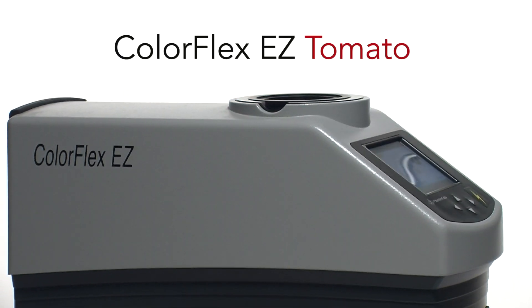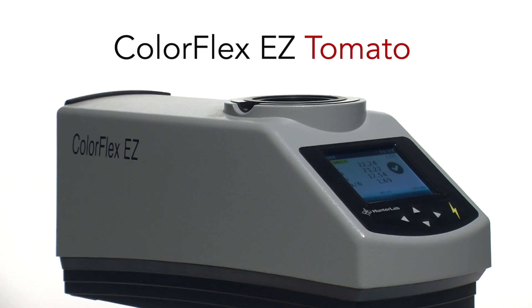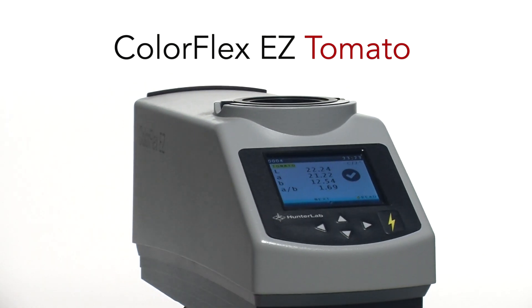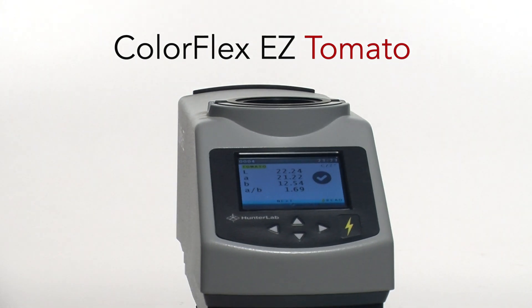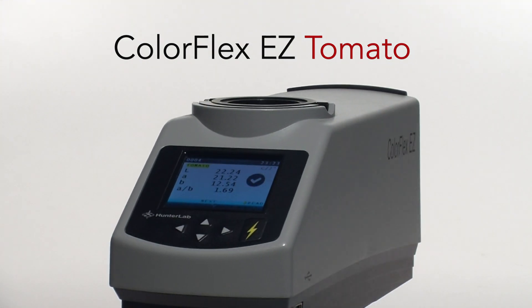The ColorFlex Easy Tomato — one of the most popular color measurement instruments in the world, used in the tomato processing industry at every step of production. Why? But more importantly, why should you consider a ColorFlex Easy Tomato?